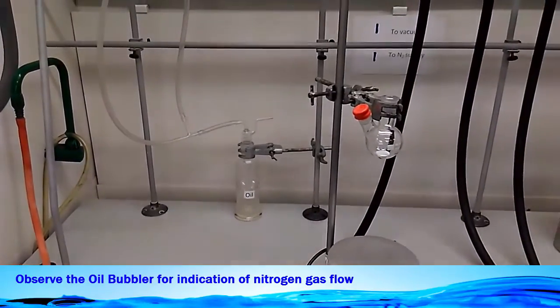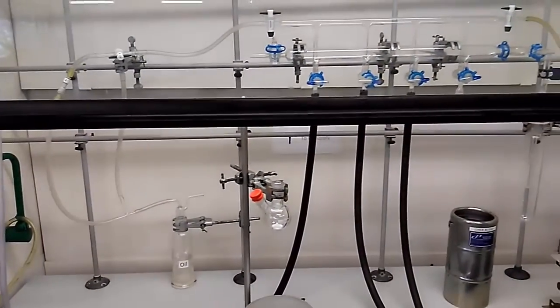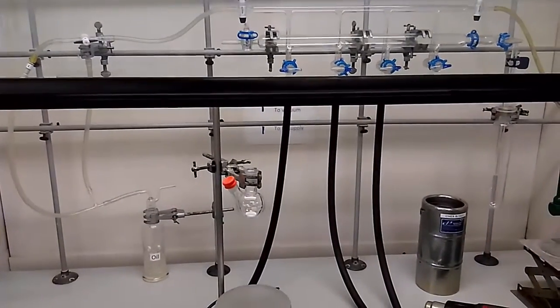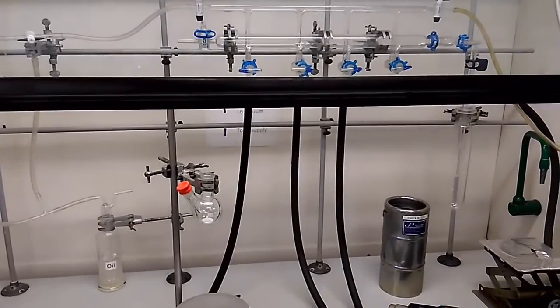So now we ensure that the whole Schlenk line is full of nitrogen. Okay, we stop the nitrogen for a while. We turn it off.